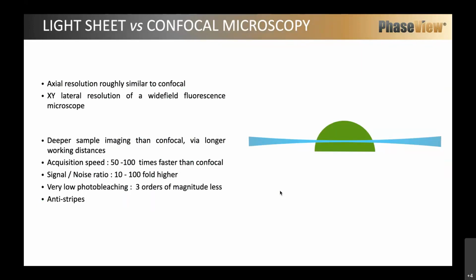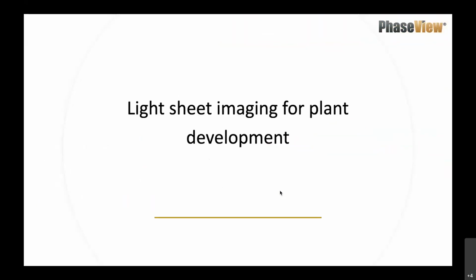It can be really interesting when we want to look at development, for example, or with weak signals. So now I will present you the Alpha 3 microscope, how we can mount our sample in this microscope, and what kind of imaging we can do.